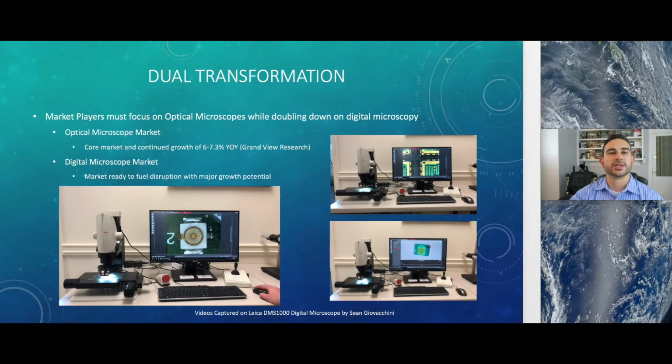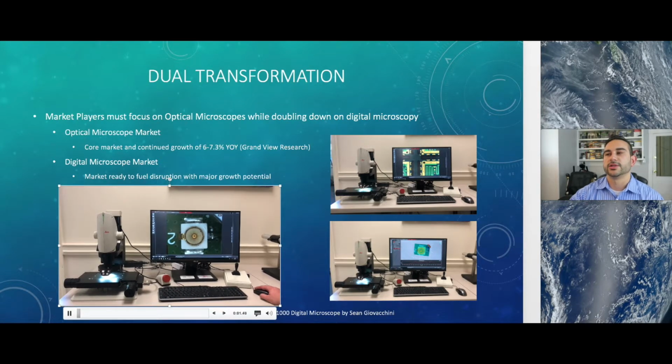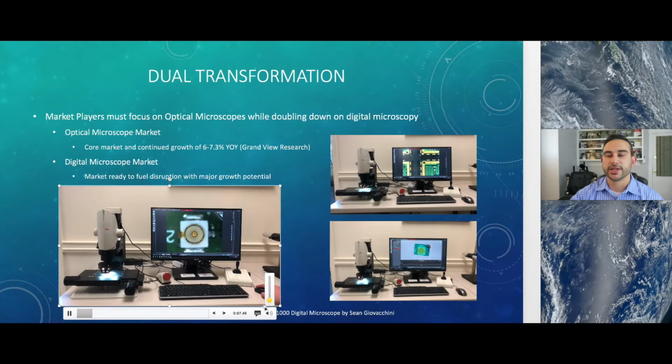The next 3 short clips show another 3D microscope, the Leica DMS 1000, and how easy it is to do X, Y, and Z stitching, but still how far this needs to go in order to be truly easy to use for any user. This first video that you see here, they're going to do something called the Z-stack, which, sometimes when you're at high magnification, not everything's in focus, so you're trying to get everything in focus and look at it in 3D.